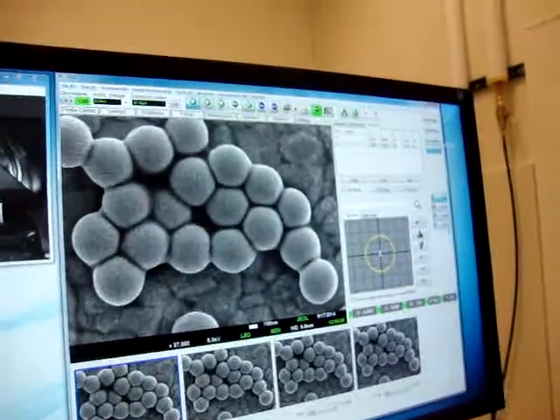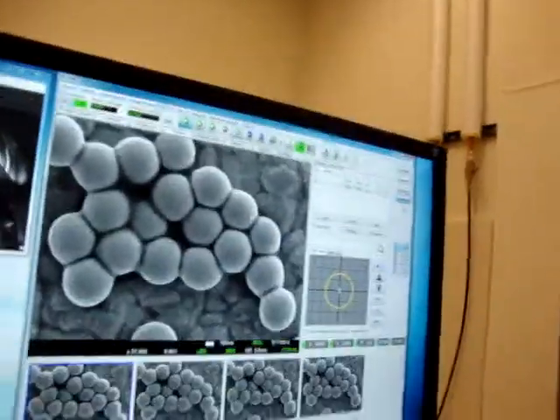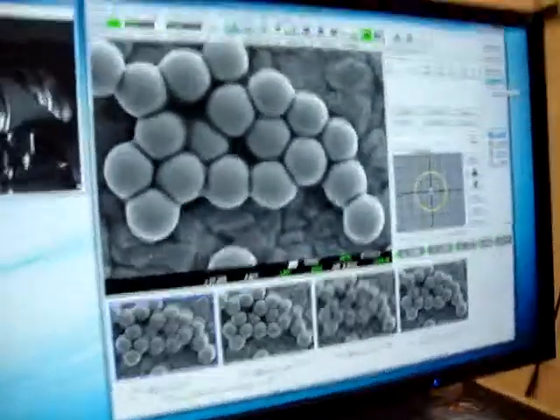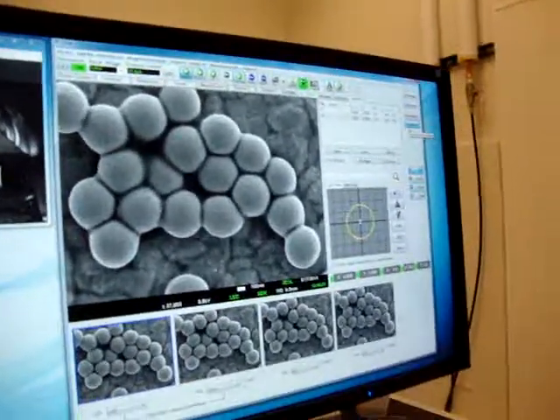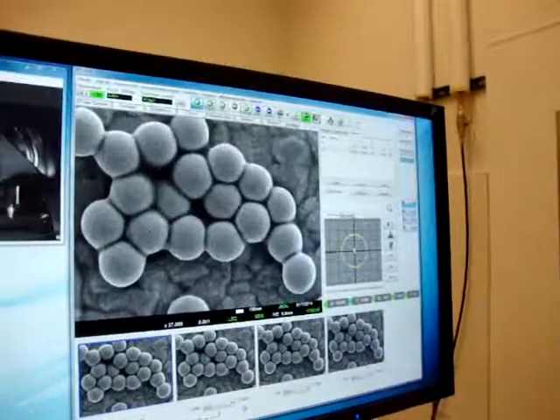You aren't going to believe this. This is the weirdest thing I've ever seen. I got a picture where the center is in focus and everything else is out. Is it a perfect circle? Yeah. Dynamic focus is probably on. You can move that thing anywhere you want, and it causes all types of weird things.